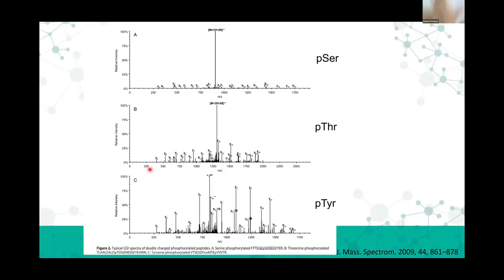You can further fragment that peptide, but that requires an MS3 event, so it's a little difficult. You can see down at the baseline, and I'll try to use my pointer here, there are Y and B ions here, but they're maybe at the 5% level. So this is where, if you're playing odds, you head to the casino, and we're looking for a peptide that has lowest stoichiometry to start with. It doesn't fly very well.